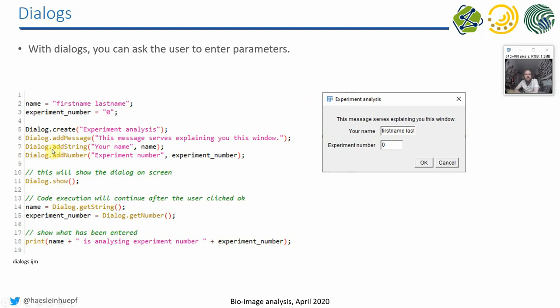And then we say, we add a string field here, where the user should enter his name. So I say here, your name, and it says here, your name. And I can also give a default value.